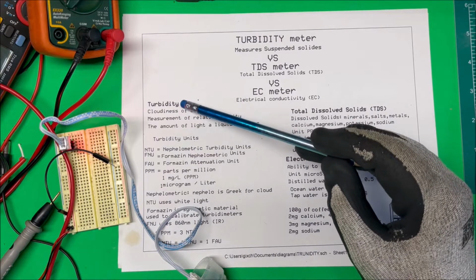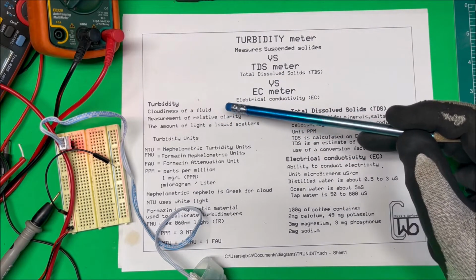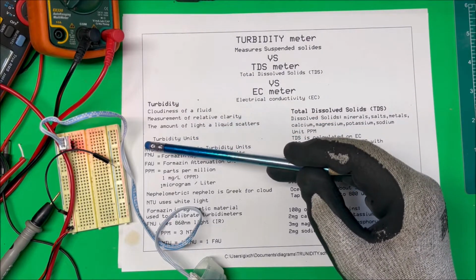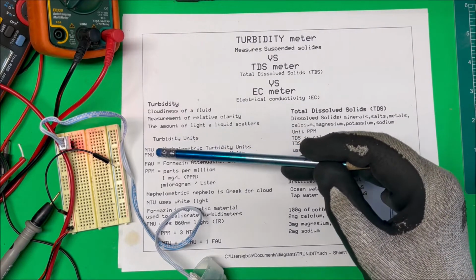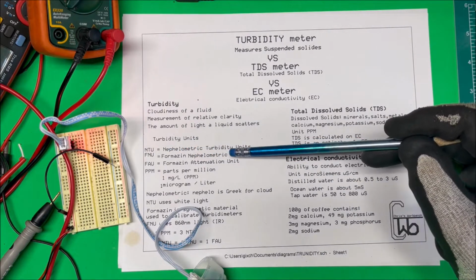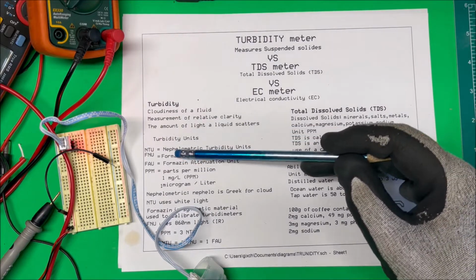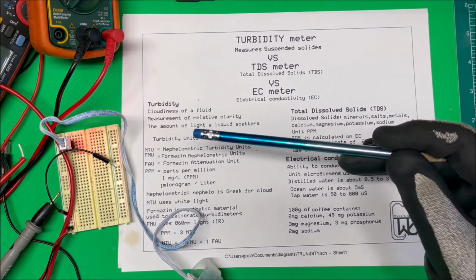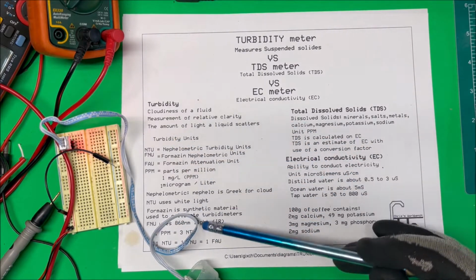So, turbidity is just the cloudiness of a fluid, and the meter measures the relative clarity or the amount of light that the liquid scatters. Now, turbidity units are measured in NTU, which is nephelometric turbidity units, or FNU, which is Formazin nephelometric units, or just attenuation units. Now, this nephelometric, it's Greek for cloudy, or clouds. So that's where that comes from.